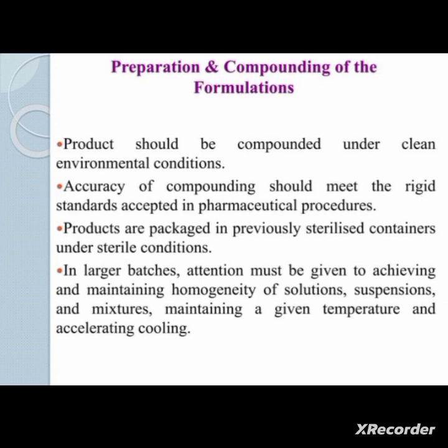Preparation and compounding of the formulations. Product should be compounded under clean environmental conditions, that is aseptic conditions. Accuracy of compounding should meet the rigid standards accepted in pharmaceutical procedures. Products are packed in previously sterilized containers under sterile conditions. In larger batches, attention must be given to achieving and maintaining homogeneity of solutions, suspensions and mixtures, maintaining a given temperature and accelerating cooling.